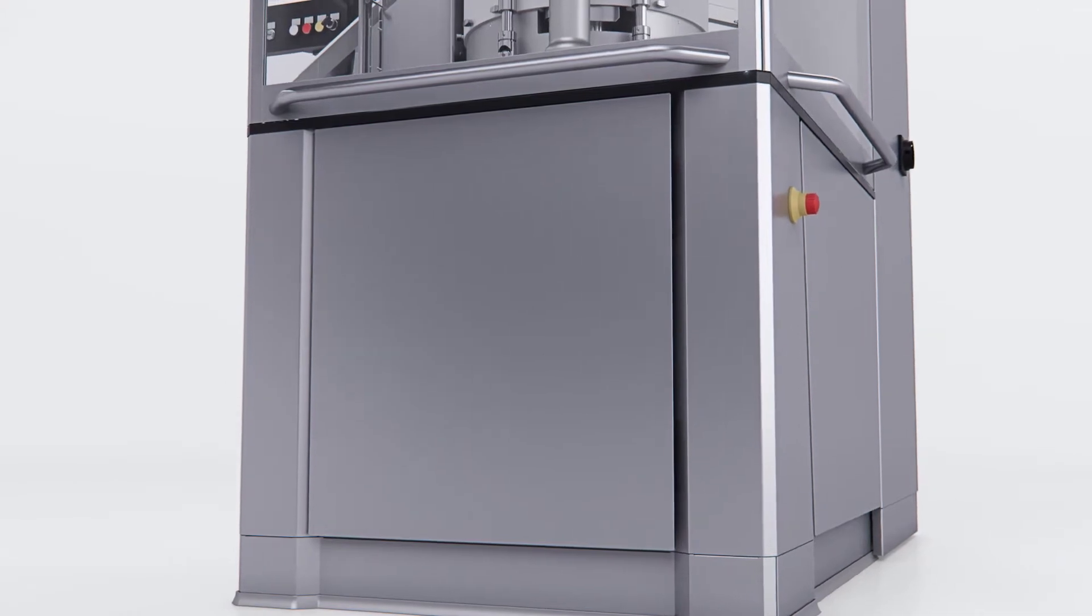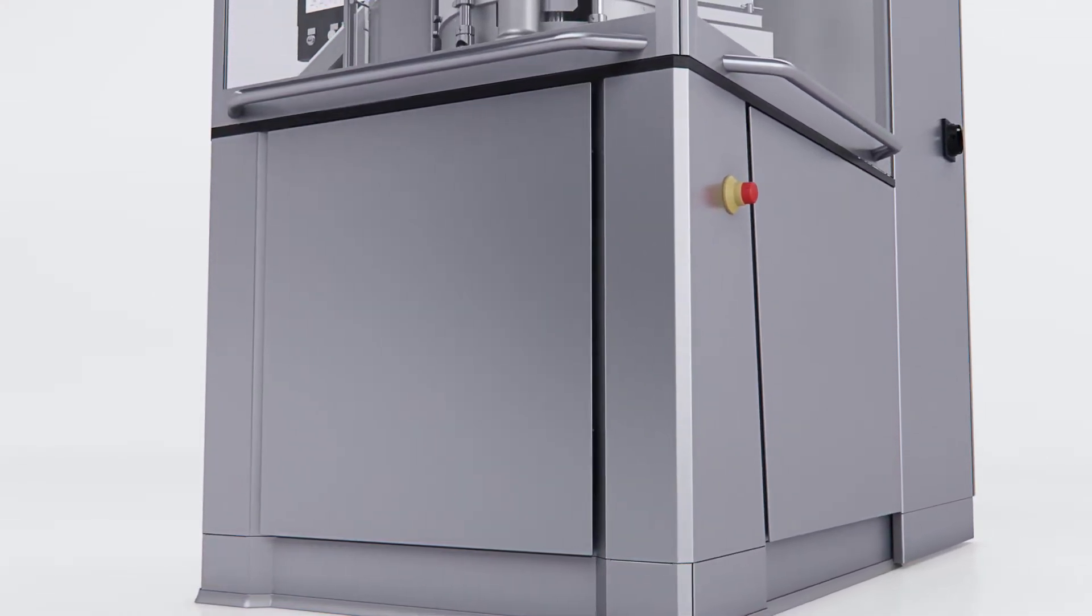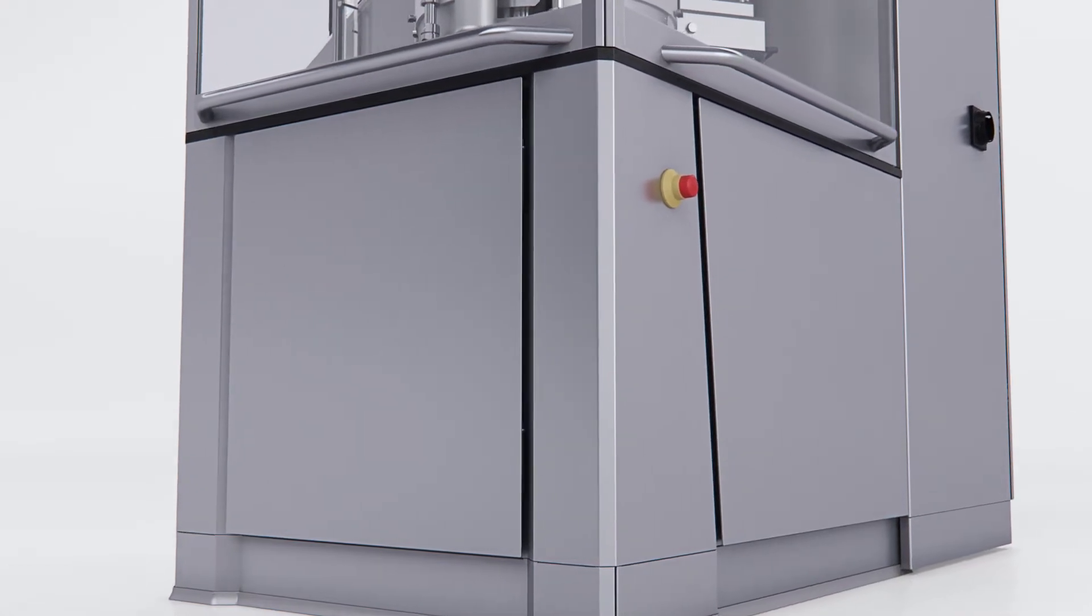Located under the carrier plate, the machine base is easily accessible through large doors and features ample free space for user-friendly maintenance.